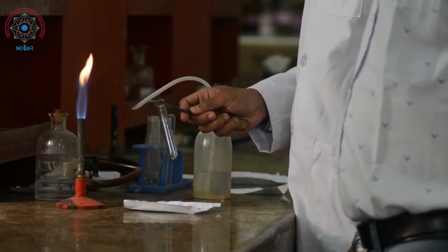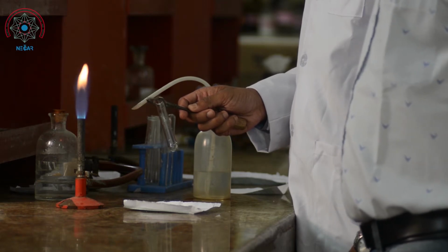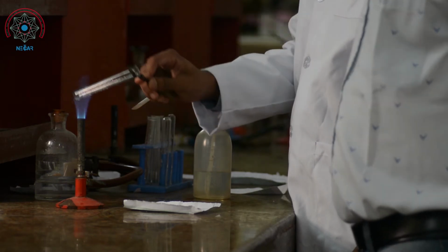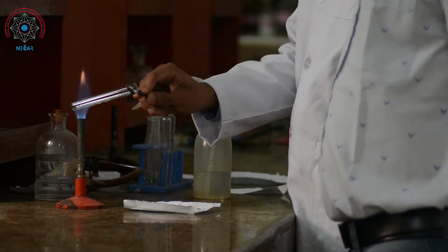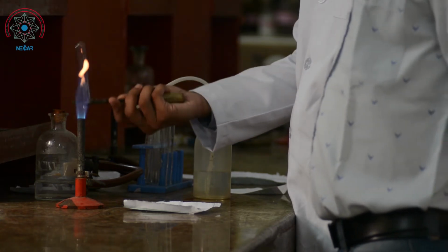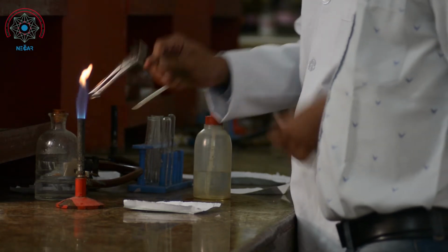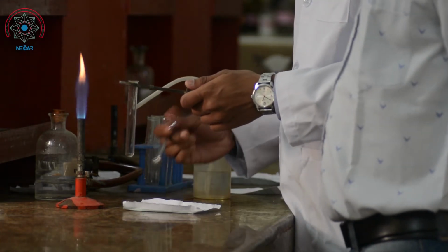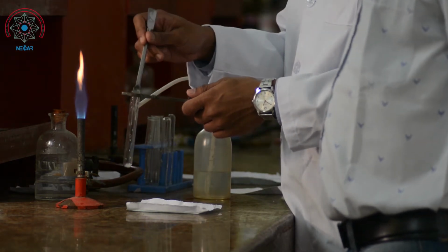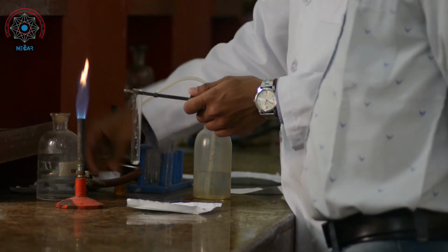Next, we will perform the dry test for acid radical. For this dry test, we have to dry the test tubes over a Bunsen burner flame. After drying, we add a pinch of salt in the test tube, and then we add dilute sulfuric acid.